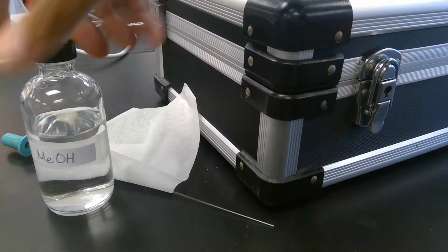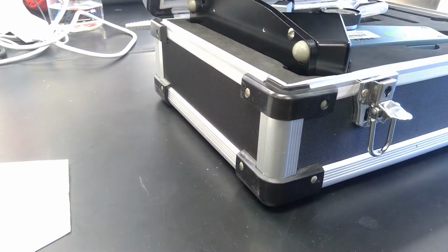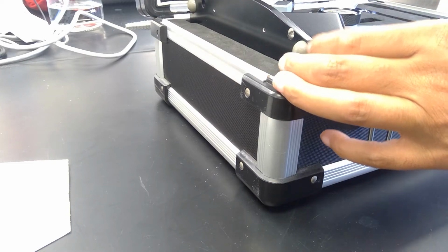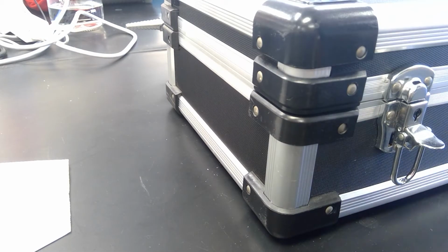So what we're going to do, let's move our reagents to the side. We want to take and open up the little suitcase, and we want to just slightly pull out the instrument. Just give it a little tug. And then we're going to move the case to the side.